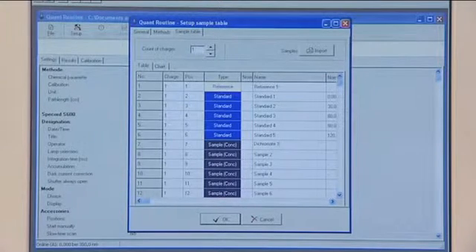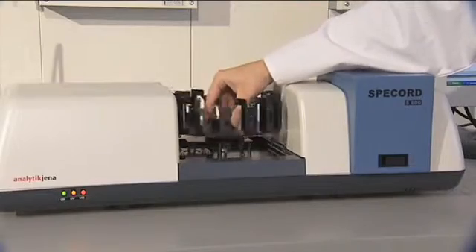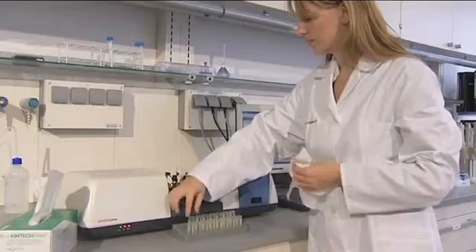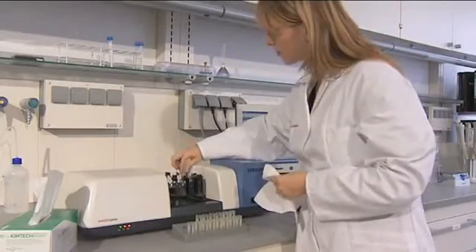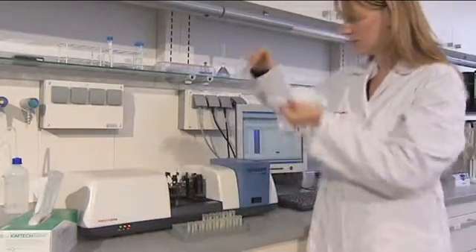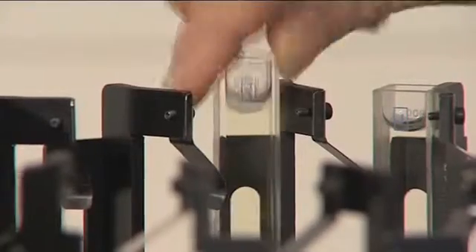Additional facilitations for routine applications are accessories for automation like the sipper system or a cell changer for 8, 15, or 50 cells. The accessory is put onto the bars of the sample compartment. The system is immediately ready for action.